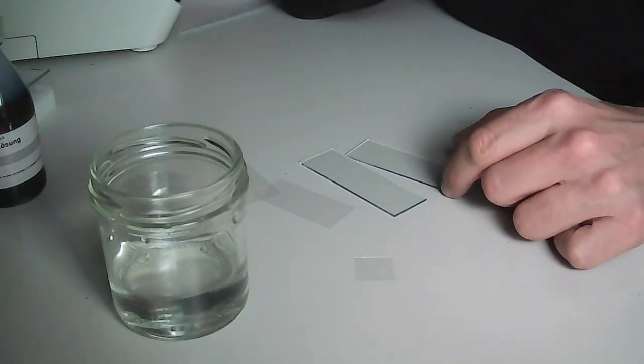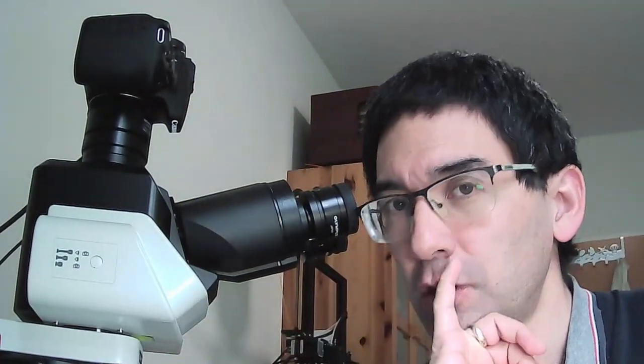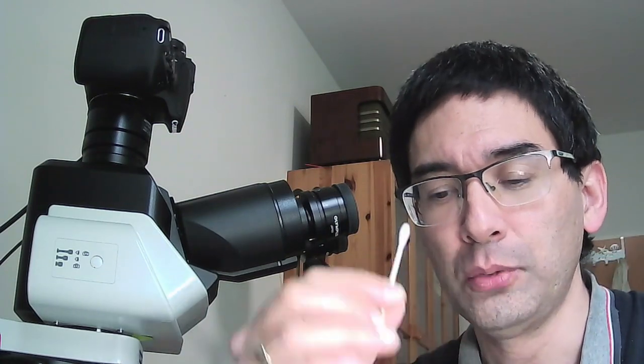So I'll be doing now the following. I'll be picking up a sample from inside my cheek. You can also use the inside of your finger, basically to scratch off some cells from the inside of your cheek, and then rub the cells here on the slide. I won't be doing this. I'm gonna, looks better this way. Rotate, just like, not quite as uncomfortable as the corona test.